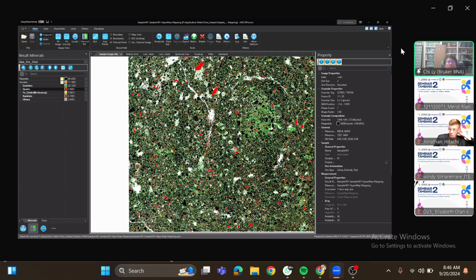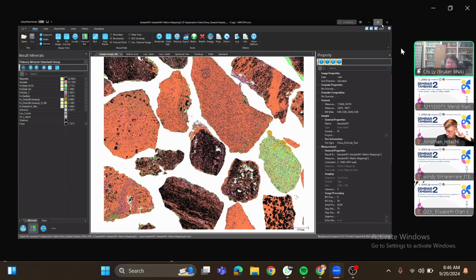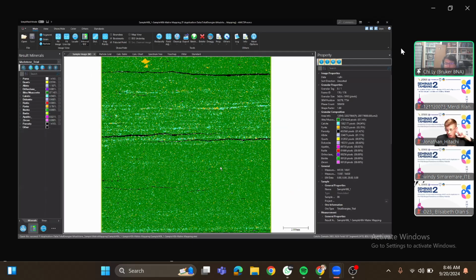So apart from iron ore, now we just move a little bit away from mining. Here, everything you've seen at the moment has been, I guess you could say, coarse grain material. So nicely mineralized material that you're going to crush and prepare, but limited to only looking at all those coarse grain materials. We can also have a look at clays. Again, I've worked with a lot of nickel laterites and had to deal with a lot of clays, but also working in oil and gas, clays are always present everywhere we're looking.